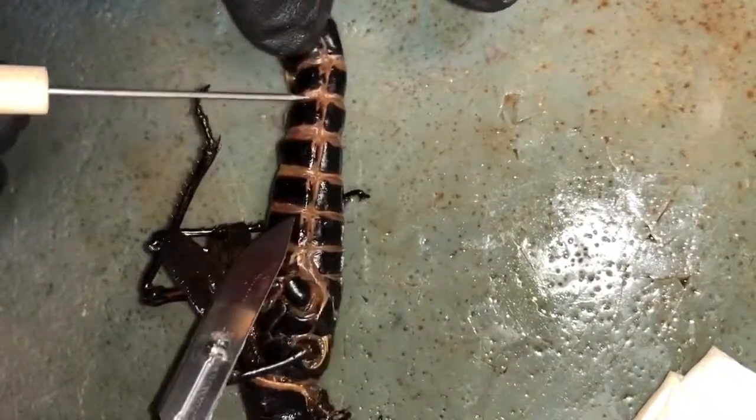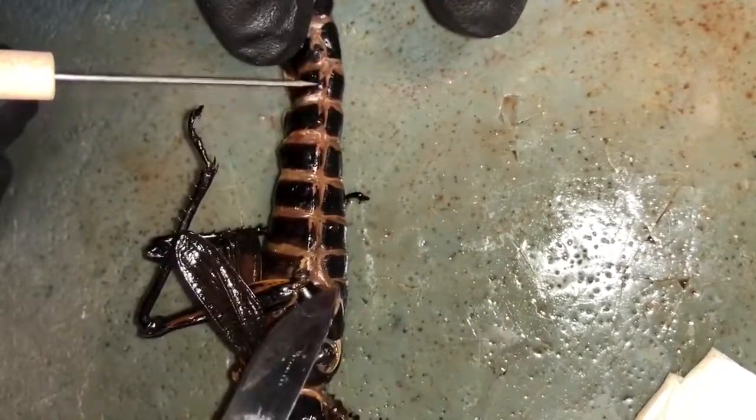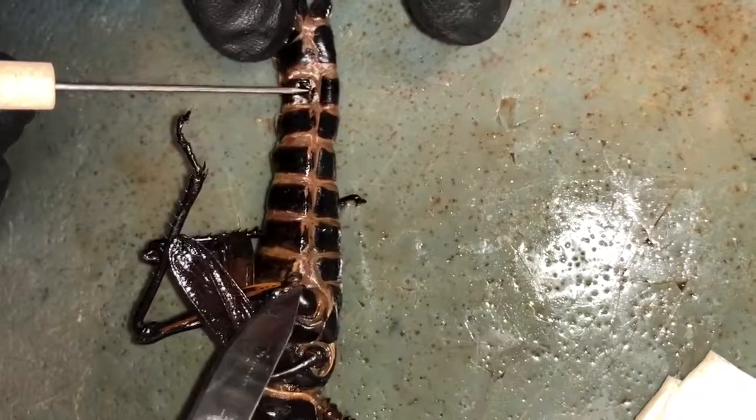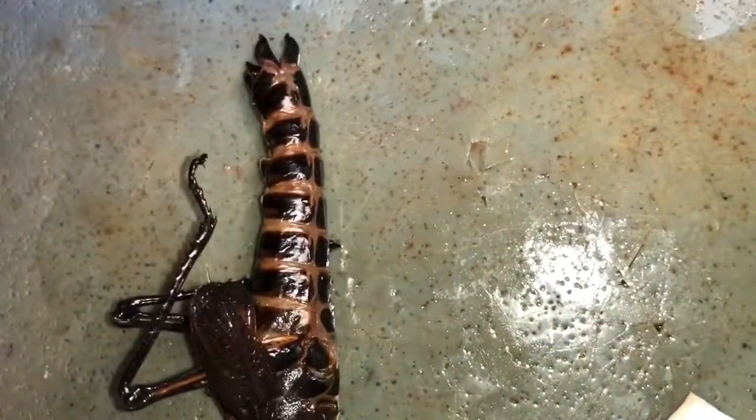I'm trying to see it in the light. I think it's on the other side. No, it should be right here. It's a little hole somewhere. Little hole right there. It's supposed to be. It's hard to see. Okay. Do you have an ovipositor? Yes, sure do. Right there. Very nice. Good job.